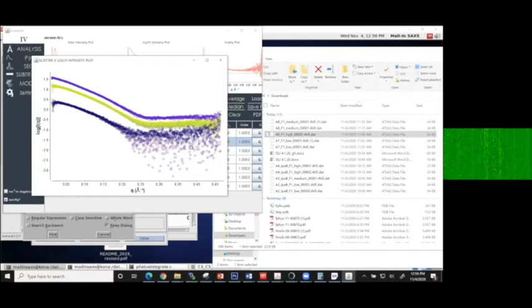And it actually is a different type of concentration dependence. It's the kind of concentration dependence where the structure is changing as a function of concentration. Okay. In this case, the sample is feeling other copies of itself around, and it's setting up like a pseudo liquid lattice of some kind. Okay. So how do I see that?